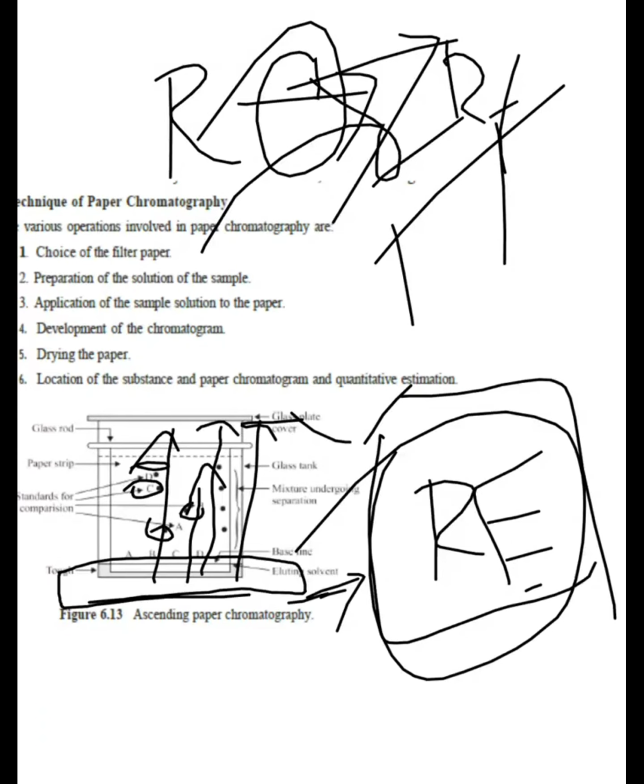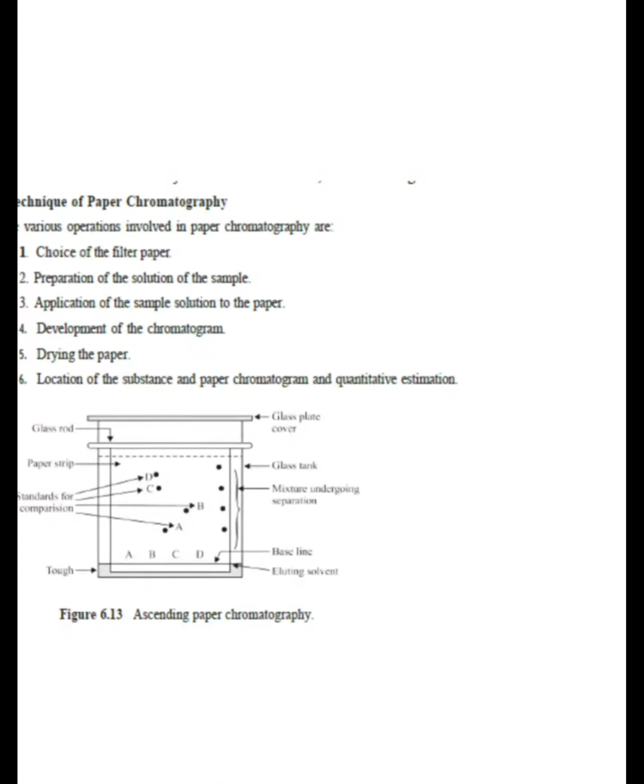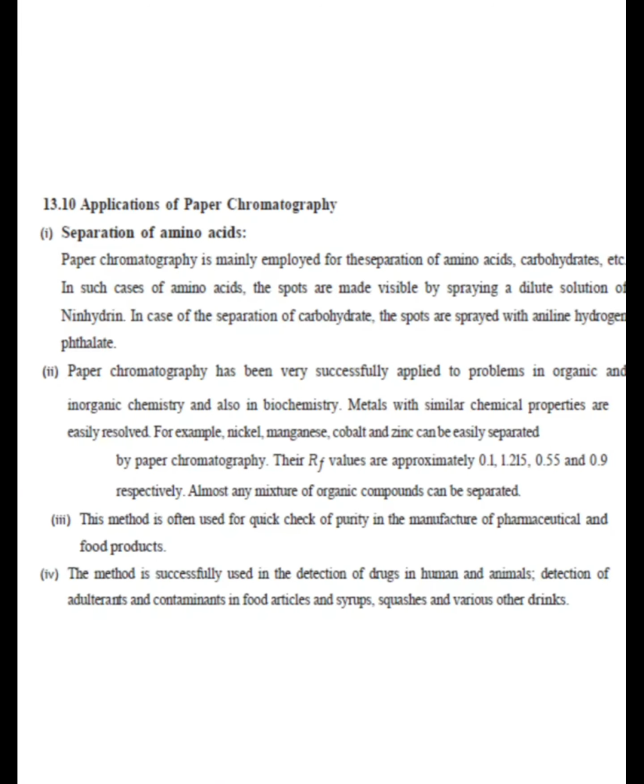And further, the technique for paper chromatography mainly depends on the choice of the filter paper used for the separation, to identify the mixture of the compounds.